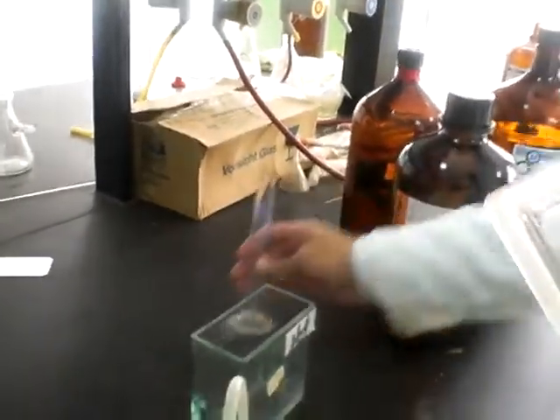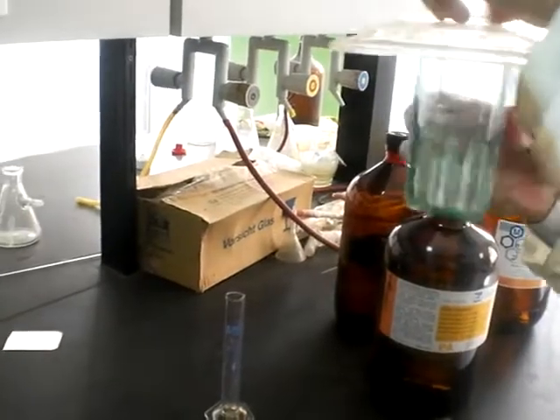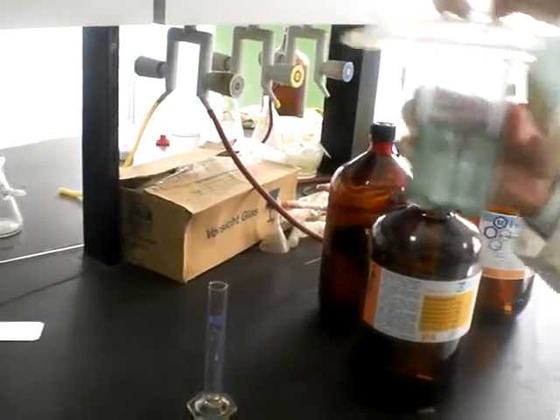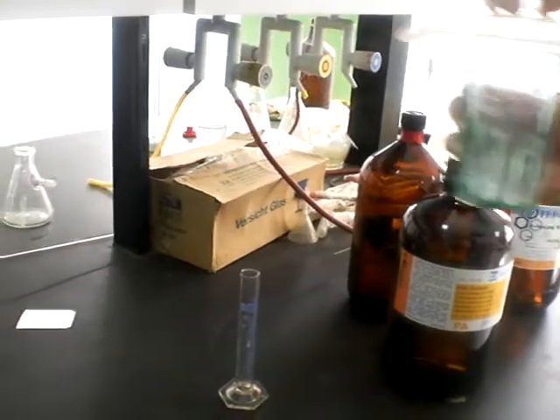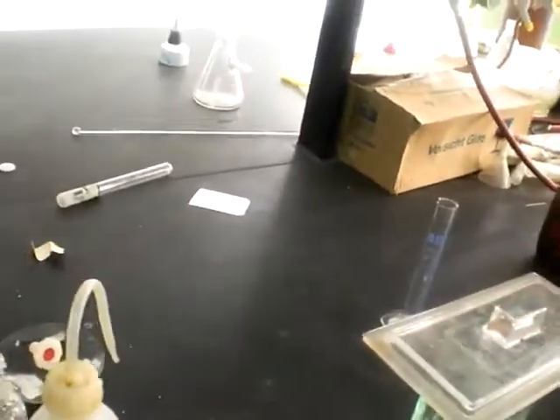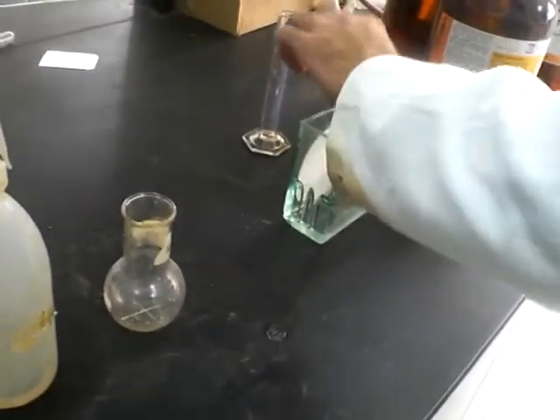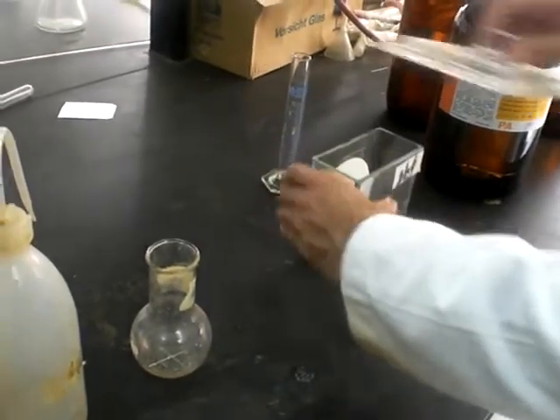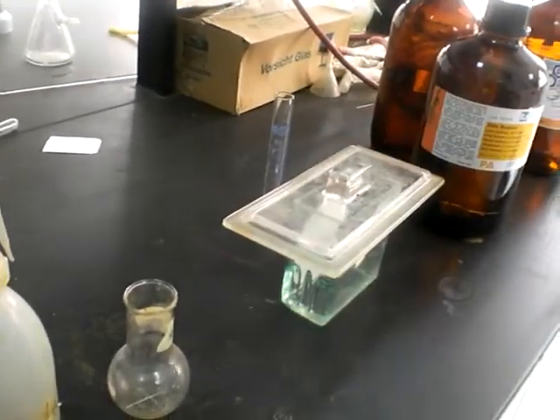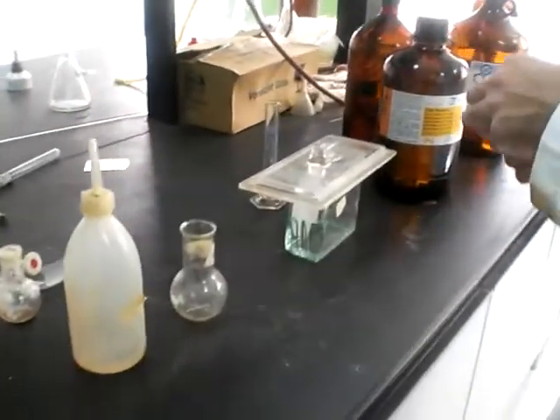We add the mobile phase into the mobile phase chamber. We mix the components well, and we leave it closed to be saturated with the mobile phase for a moment. Then the filter paper here will enhance the distribution of the vapor phase and saturate the whole chamber with the mobile phase vapors.